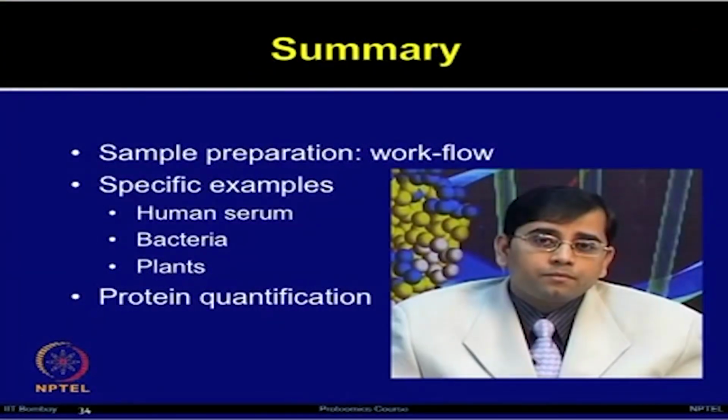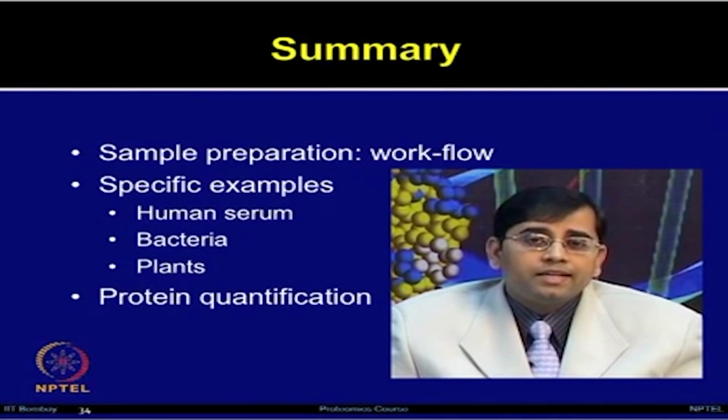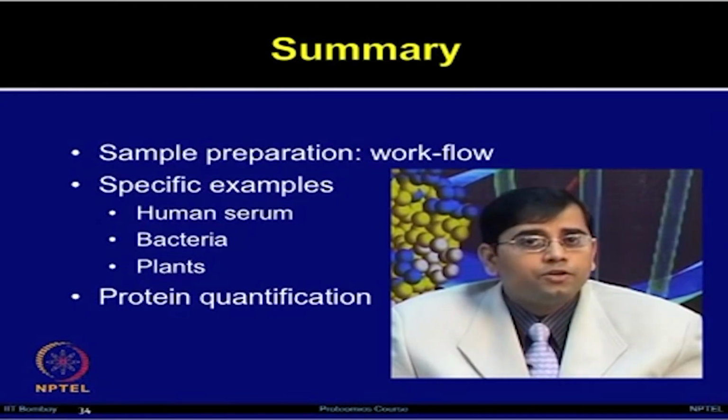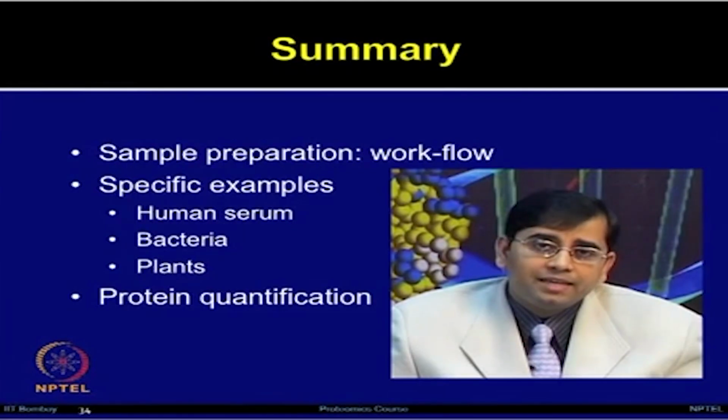So, in summary, in the last 3 lectures, we talked about strategies for sample preparation. I gave you a workflow where we talked about different types of lysis methods.